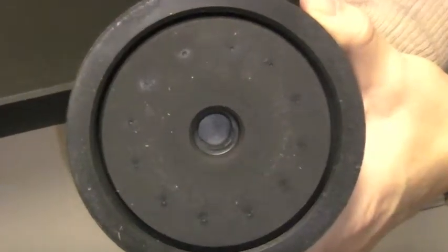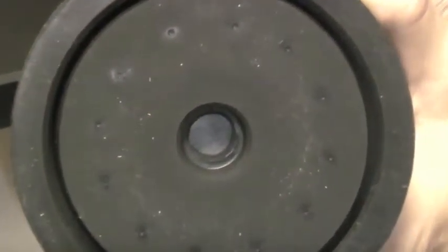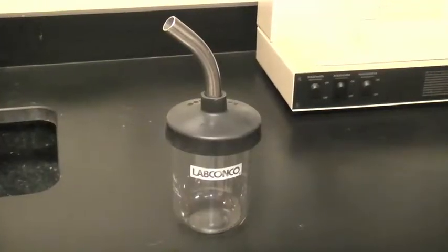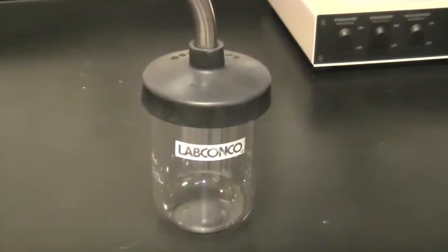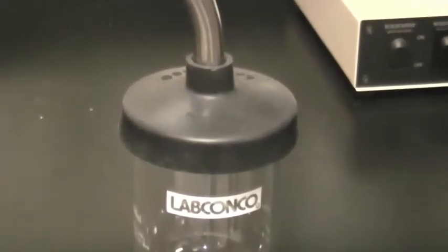When viewing the underside of the lid, the filter paper should completely cover the hole. Snap the lid and adapter on the flask until a tight seal is formed and installation is complete.